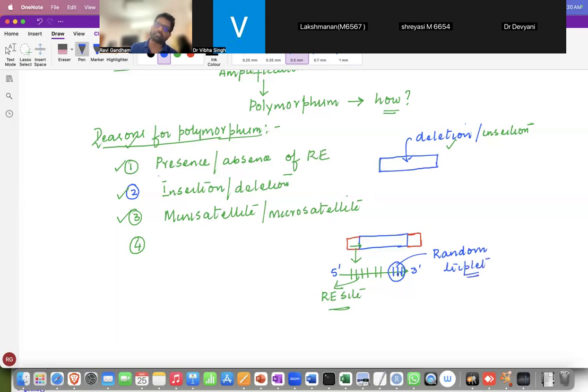primers. Because of this incorporation, the number of bands that are amplified will be reduced, right? Depending on the variation of these triplets in these primers, there is a possibility that the primer would exactly bind to that particular adapter or not for amplification, and thereby reducing the noise, in the sense that you will not be getting a smear. Otherwise, when cut with the restriction enzyme and using your adapters and amplifying, you'll have so many fragments. When you run it on the gel, there is every possibility that you will get a smear.